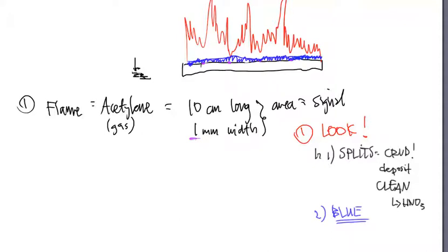Now, the flames up here at the top, well, this is uneven. It doesn't have to be equal because that's not where the light beam is going to be shining. The light beam is actually going to be looking through the base of the flame down here at the very bottom. And that's why this area is so important in here. Okay? So this should be a very light blue color. And this is where the hottest part of the flame is going to be located. And this is where your measurements are going to take place.